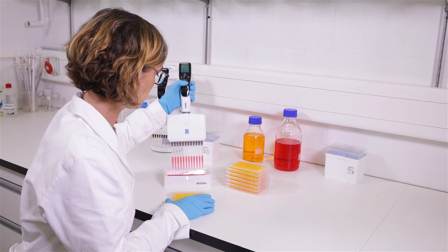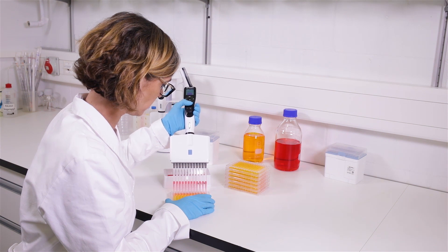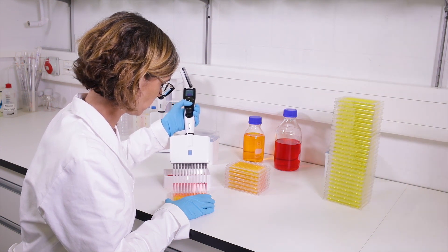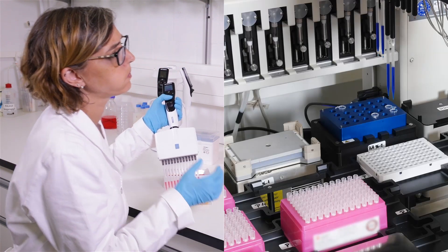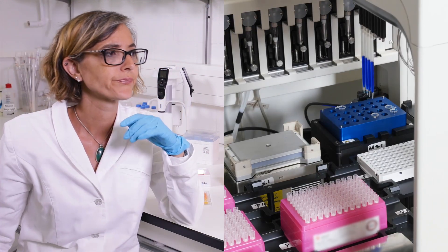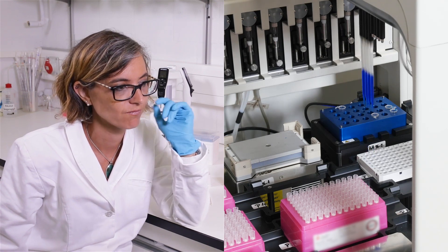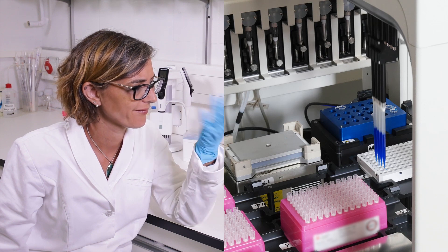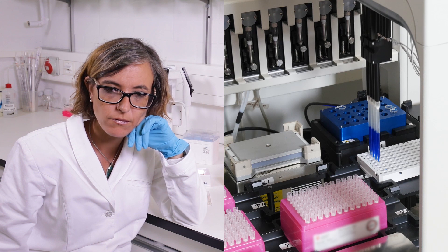Multi-channel pipettes are great tools for pipetting small to medium quantities of plates. However, what can you do when faced with an ever-increasing workload? High-throughput robotic systems exist, but they're associated with high costs and require long training and setup time. Is there anything which combines handheld pipettes' ease of use together with the throughput of robotic systems?